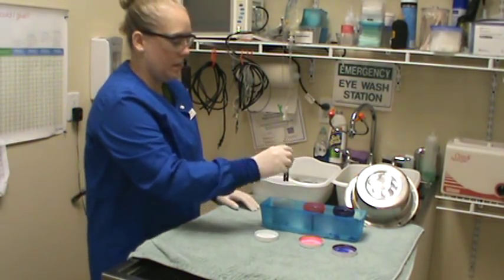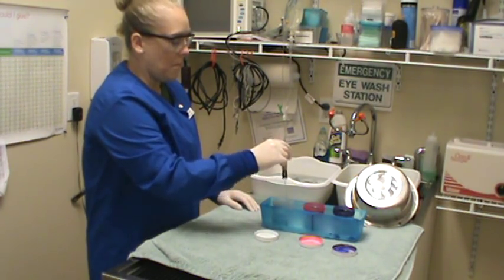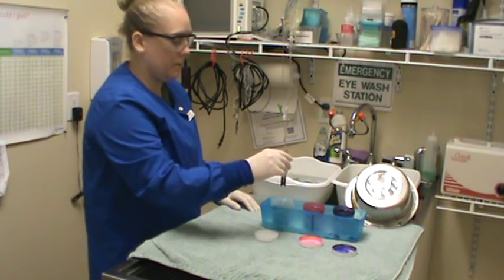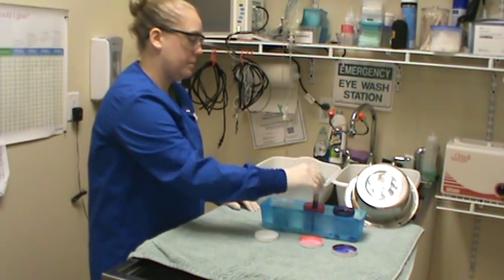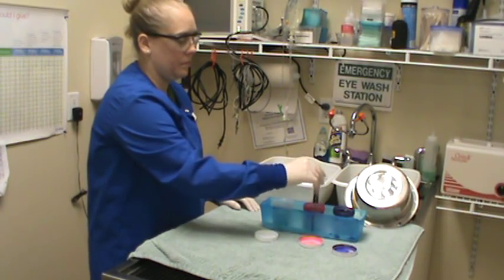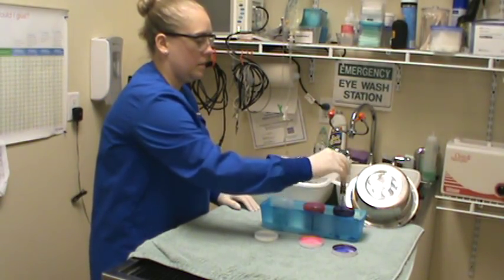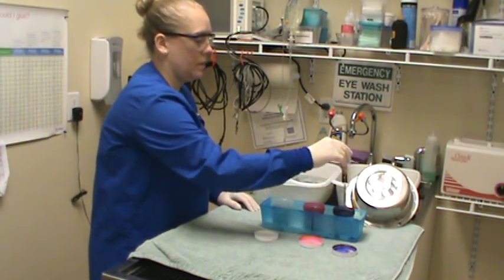We're going to go ahead and insert it into the fixative ten times, letting excess drain off into each jar as we go in between. Ten times in the Eosin stain number two, letting that drain off as well. And then a third stain — the dark blue — ten times in that as well, for about one second each.